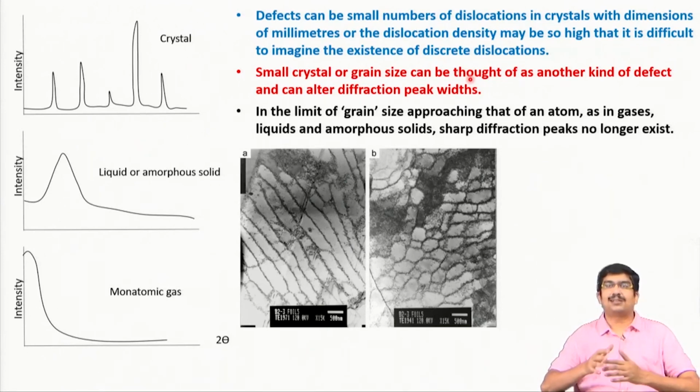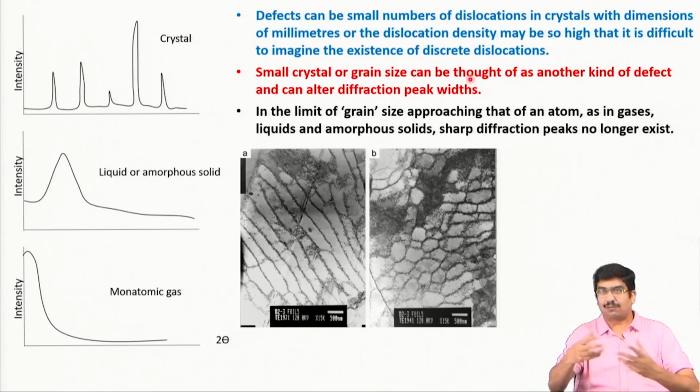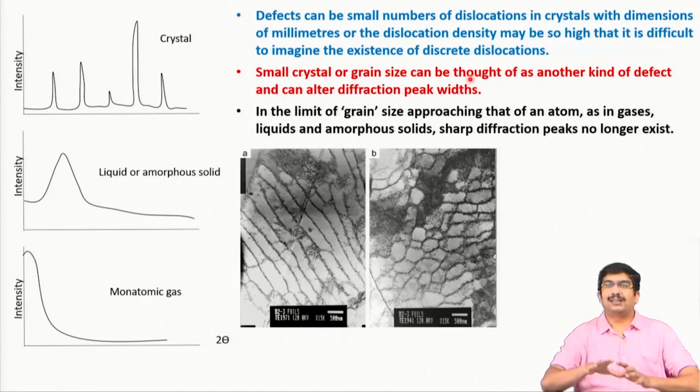As we discussed with Bragg's law, an idealized material has to be an infinite array of these points, just in order to have exactly a line function. But our crystals are of finite size, which means they have interfaces. If it is a single crystal, you will have an interface with, let us say, air or another material. If it is a polycrystalline material, you will have grains, which are essentially single crystals, separated from others by grain boundaries.